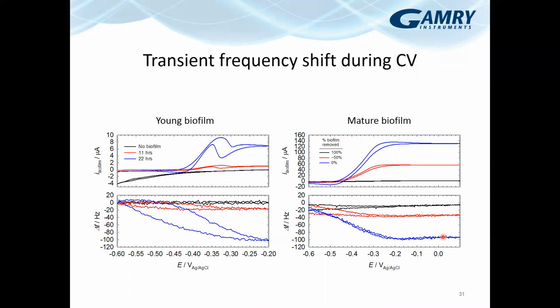Can we use this method to evaluate the ionic liquid adsorption onto the electrode surface during electrolysis? It seems specific, but how about it? Yeah, that depends on the viscosity of your ionic liquid. I think you would first have to establish that you could get the quartz crystal to resonate in your ionic liquid. For these ionic liquids, I would recommend that you not use the Absorption Probe and actually use the standard cell that comes with the resonator or other QCM.